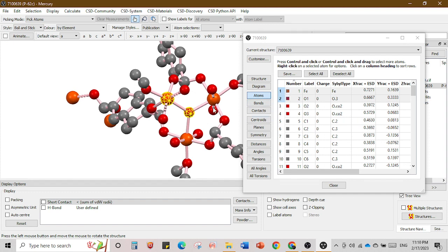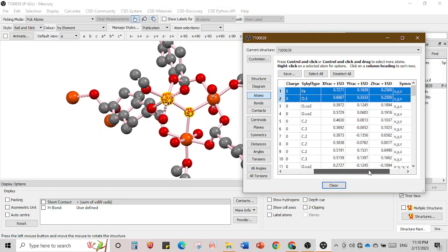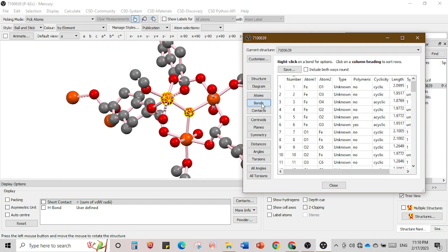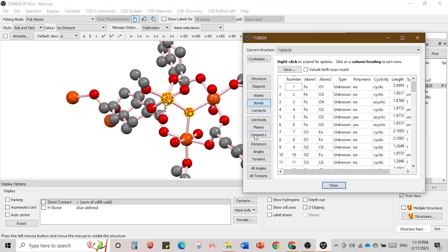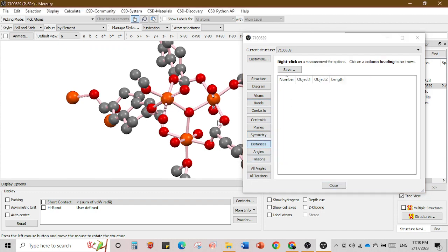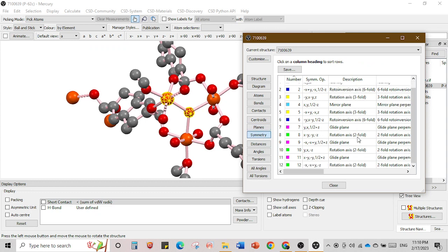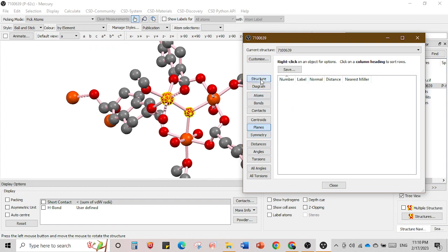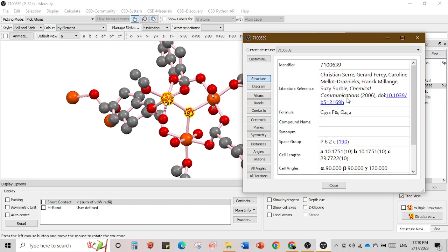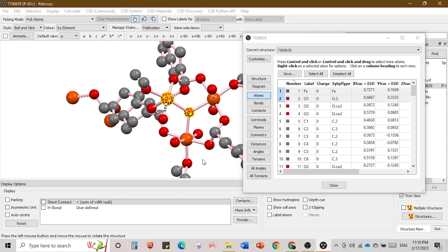The atom list helps you understand bond distances — for example, to know the bond distance between iron and the bridging oxygen (mu3 oxygen), you click that row and you can see the first and second atom and their parameters. Go to 'Bond' and you will know the bond length for each selected atom. You can also see available planes, symmetries, space group, and different rotations possible in the crystal structure.